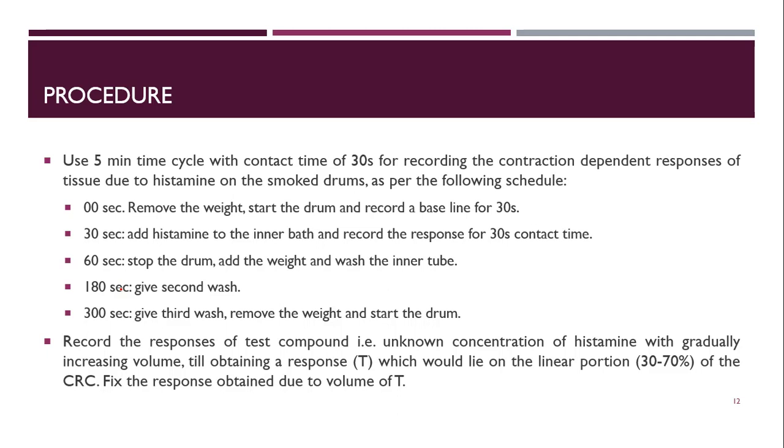How do we divide this 5-minute time cycle? At 0 seconds we have to remove the weight and start the drum, and we have to record the baseline for 30 seconds. Then at 30 seconds we have to add the histamine to the inner bath, and we have to record the response for 30 seconds, that is the contact time.